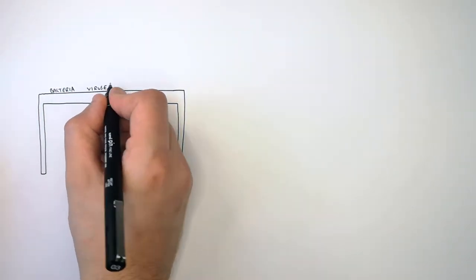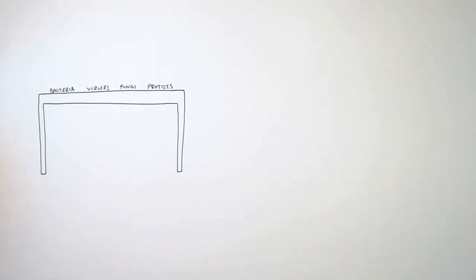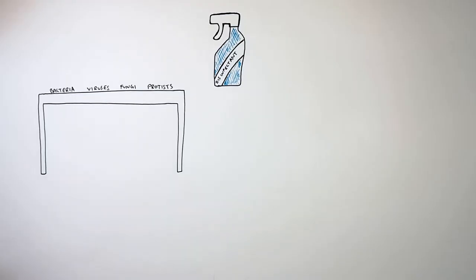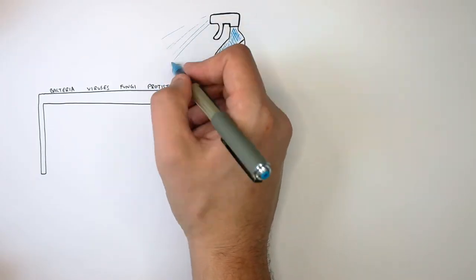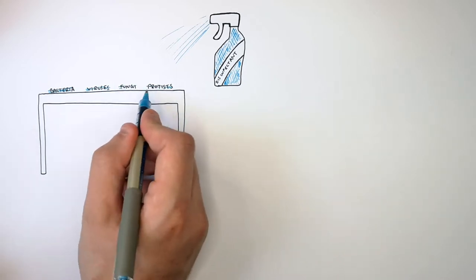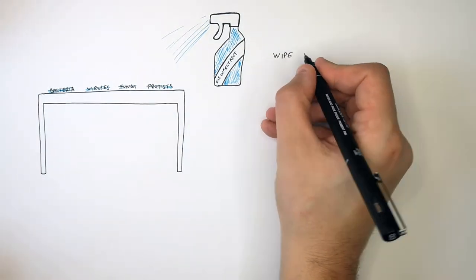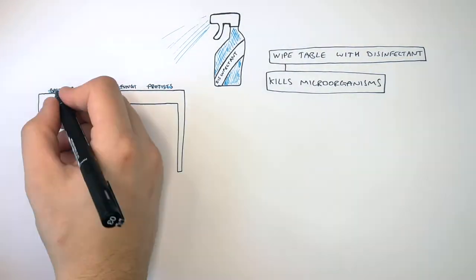Before you inoculate your agar plate with bacteria, you must kill all the microorganisms and pathogens on the surfaces you're going to use. On those surfaces you may find bacteria, viruses, fungi, and protists. You're going to use a disinfectant — spray it all over your table or bench. This will kill all the pathogens and microorganisms on the bench. Remember to wipe the table with disinfectant to kill the microorganisms.